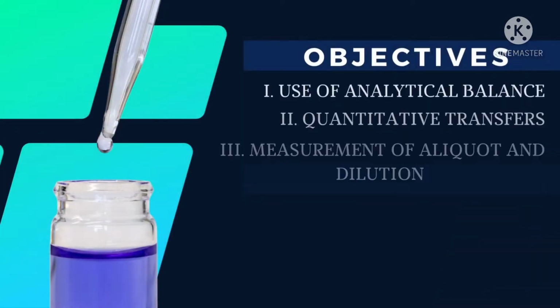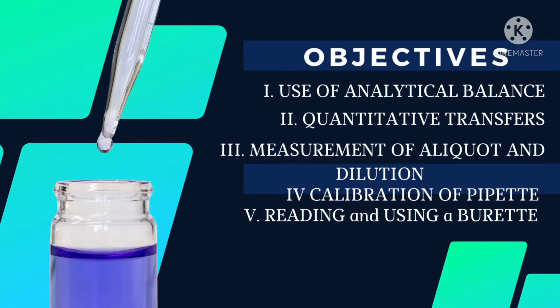Analytical chemistry. The scope of this video is about the use of analytical balance, quantitative transfers, measurement of aliquot and dilution, calibration of pipette, and lastly, reading and using of a burette.